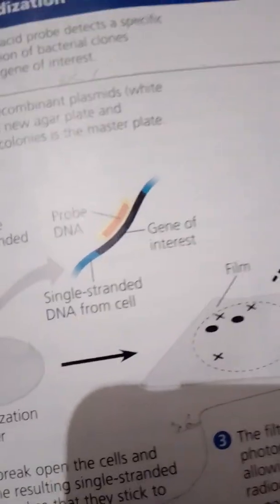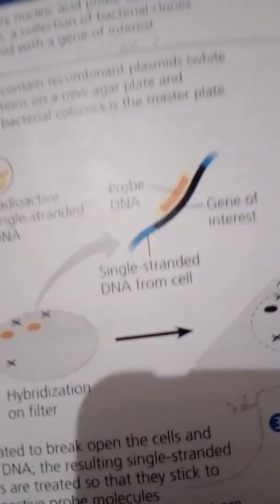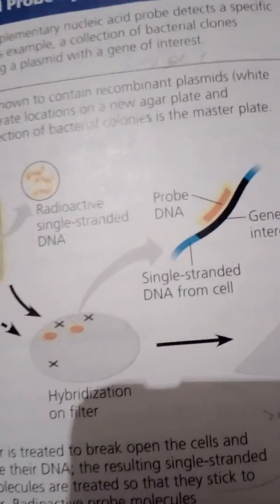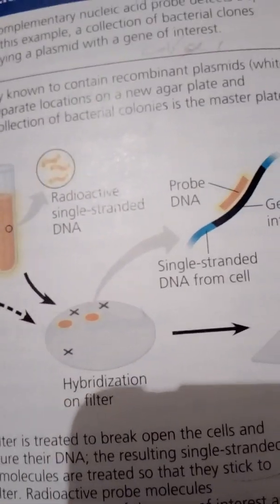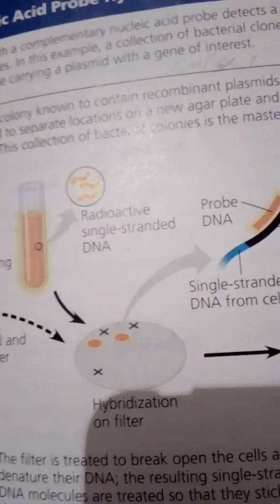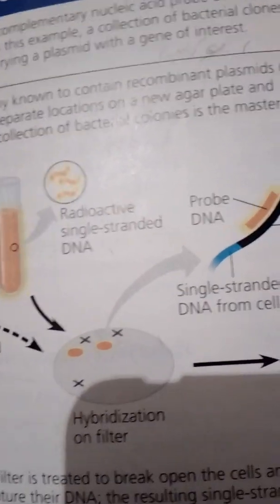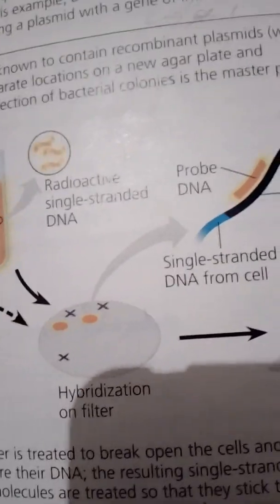Certain bacteriophages are also common cloning vectors for making genomic libraries. Fragments of foreign DNA can be spliced into a phage genome, as into a plasmid, by using a restriction enzyme and DNA ligase. An advantage of using phages as vectors is that a phage can carry a larger DNA insert than a bacterial plasmid. The recombinant phage DNA is packaged into capsids in vitro and introduced into a bacterial cell through the normal infection process.